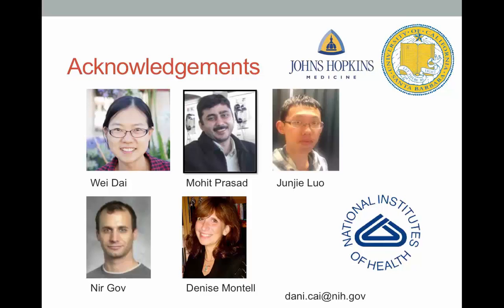Thank you very much, Danny. That was a wonderful presentation. I would like to open the floor to some questions. If there are people in the audience who would like to ask Danny a question regarding her research, please type your question into the chat window. And I will get questions started while we wait for others.